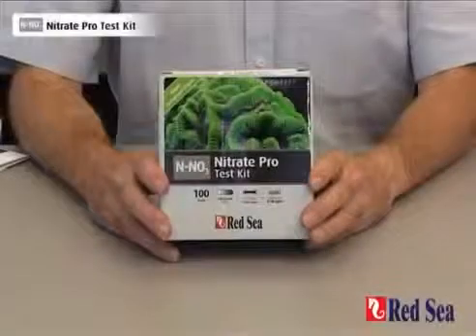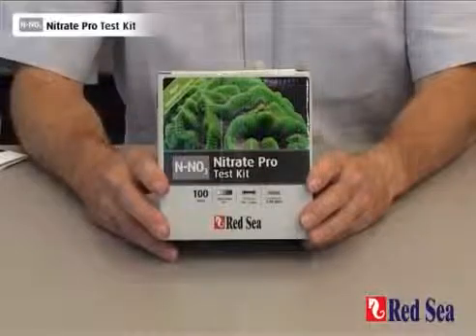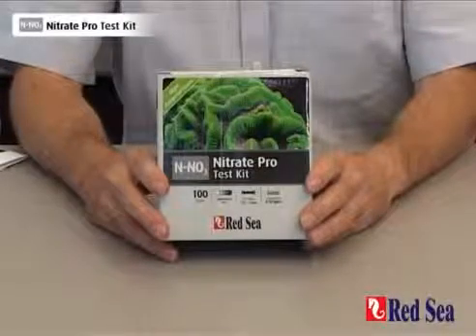Thank you for purchasing Red Sea's Nitrate Pro Test Kit. The purpose of this video is to demonstrate how the test is performed.